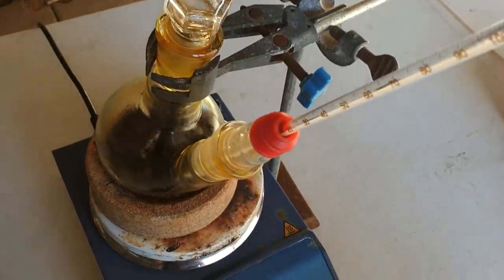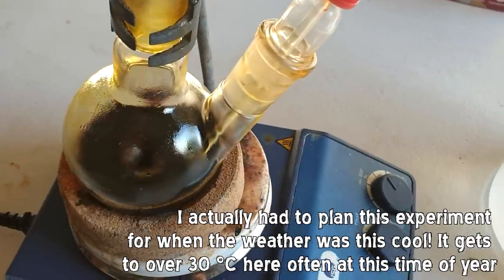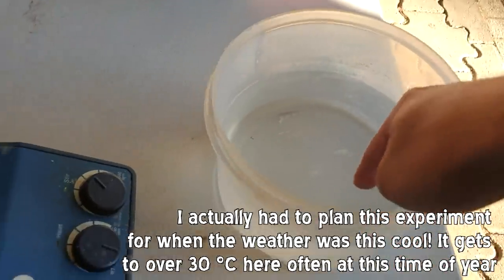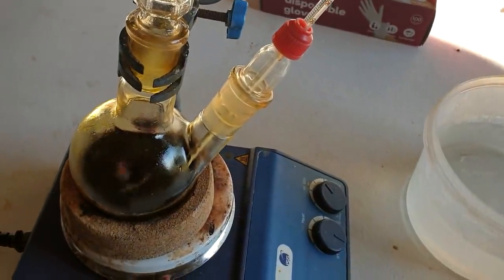What I'm doing is I'm heating it up now. Room temperature is about 25 degrees, which is about where we want it. So I'm just letting it warm up on its own. I'm not using any heating. We're sitting in this water, which is still pretty cold, about 15 degrees. So I'll let it just warm up over the next little while.